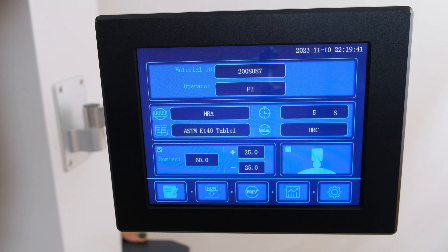In this menu, the parameters for your specific sample or range of tests may be set. These details include the name of the operator, the part or sample identifier, the scale at which the operator is testing in, test duration, tables for converting to other scales based on material and standard commission, tolerance parameters for go-no-go, and convex correction based on the radius.